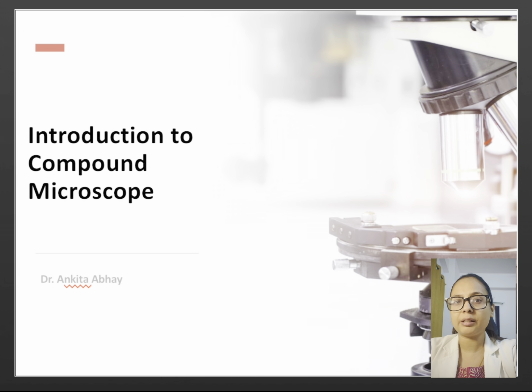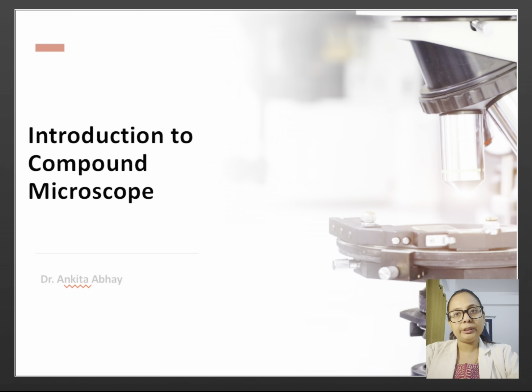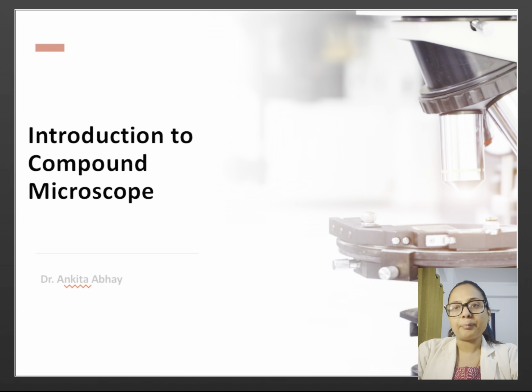This topic is very important for second year MBBS students, especially because it is commonly asked in the first terminal pathology practical examination. And also for the newly joined residents, as when you go to the residency, many of you will not be able to understand how to use a microscope. Let's understand this in a very simple and practical way.